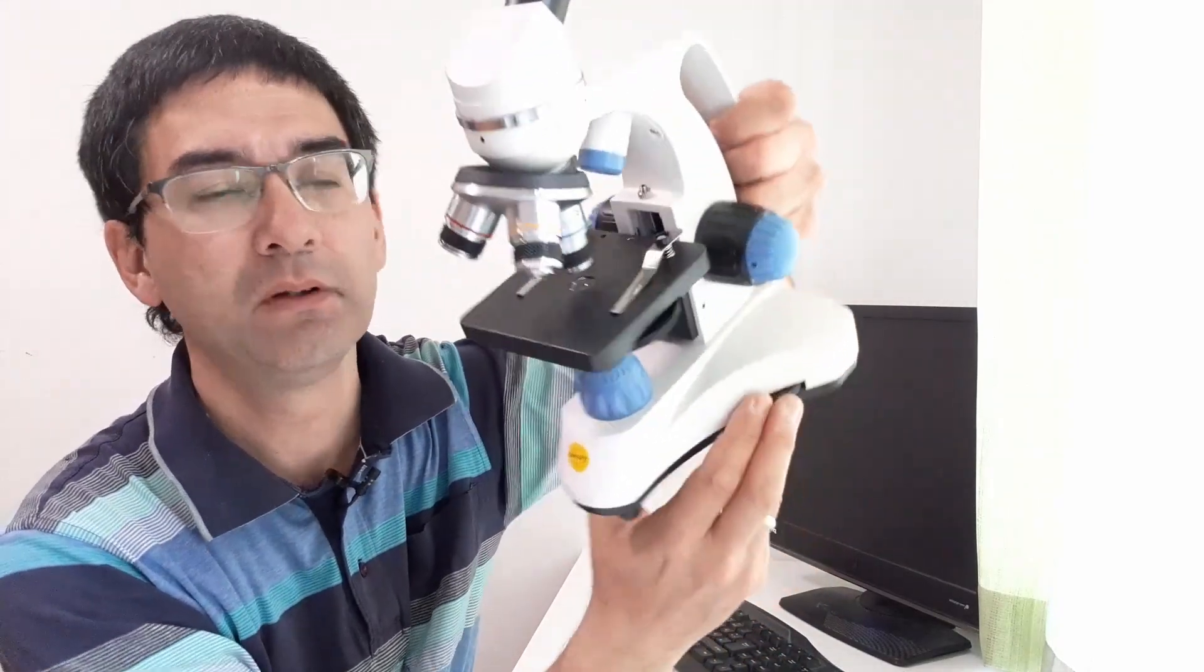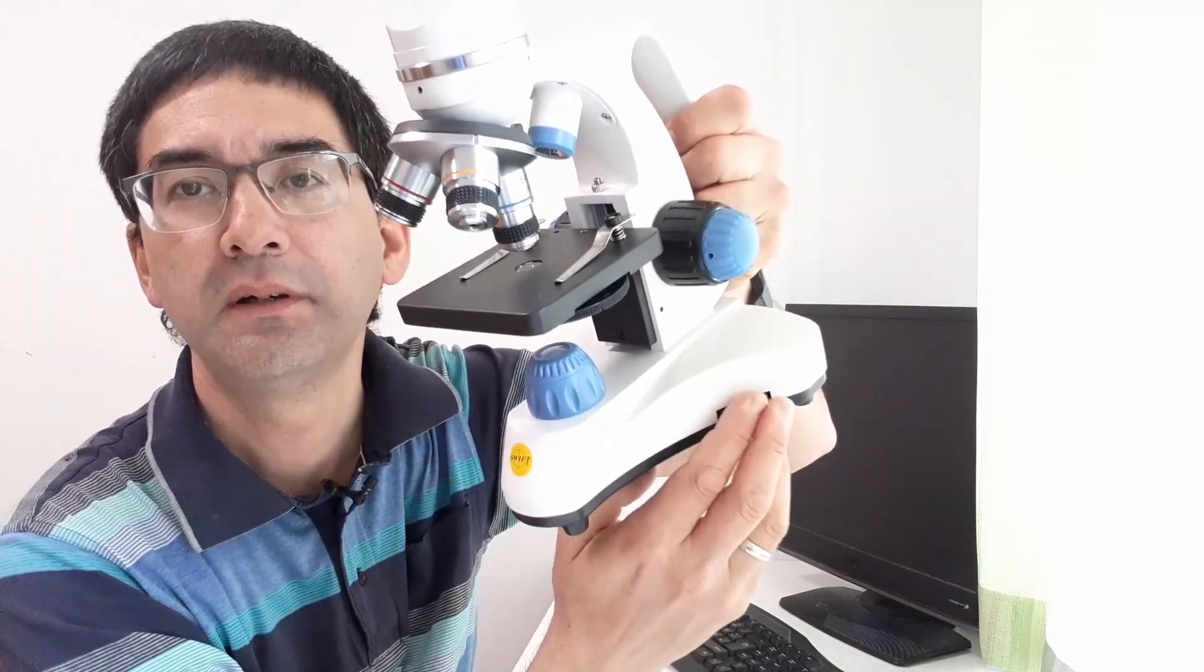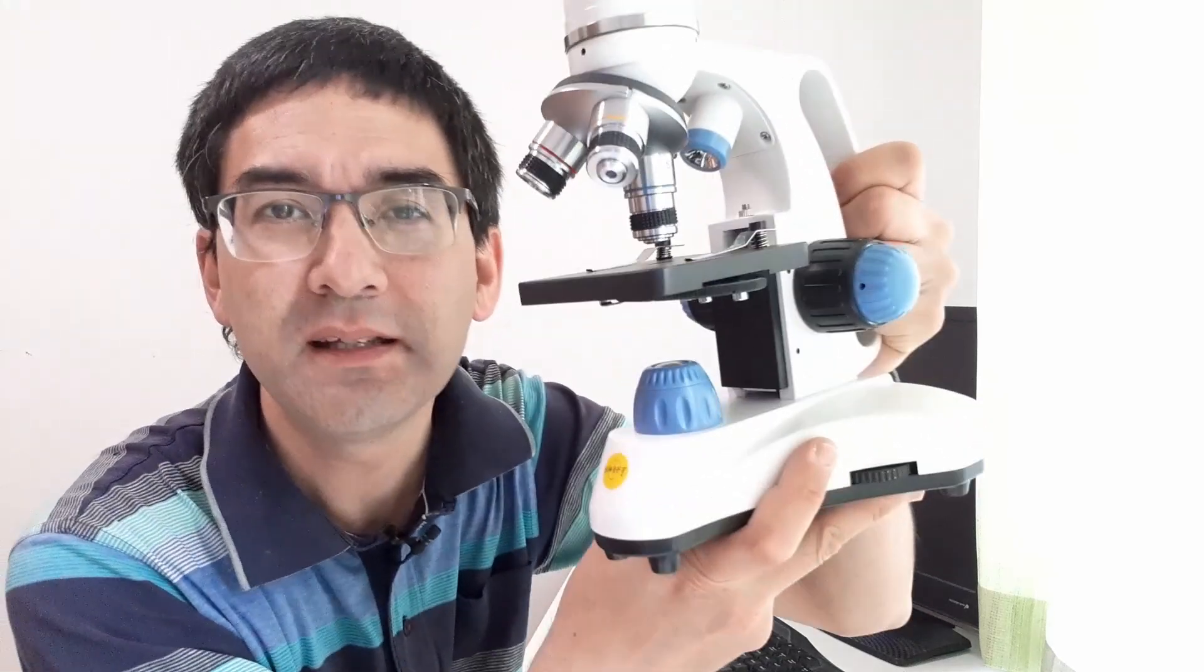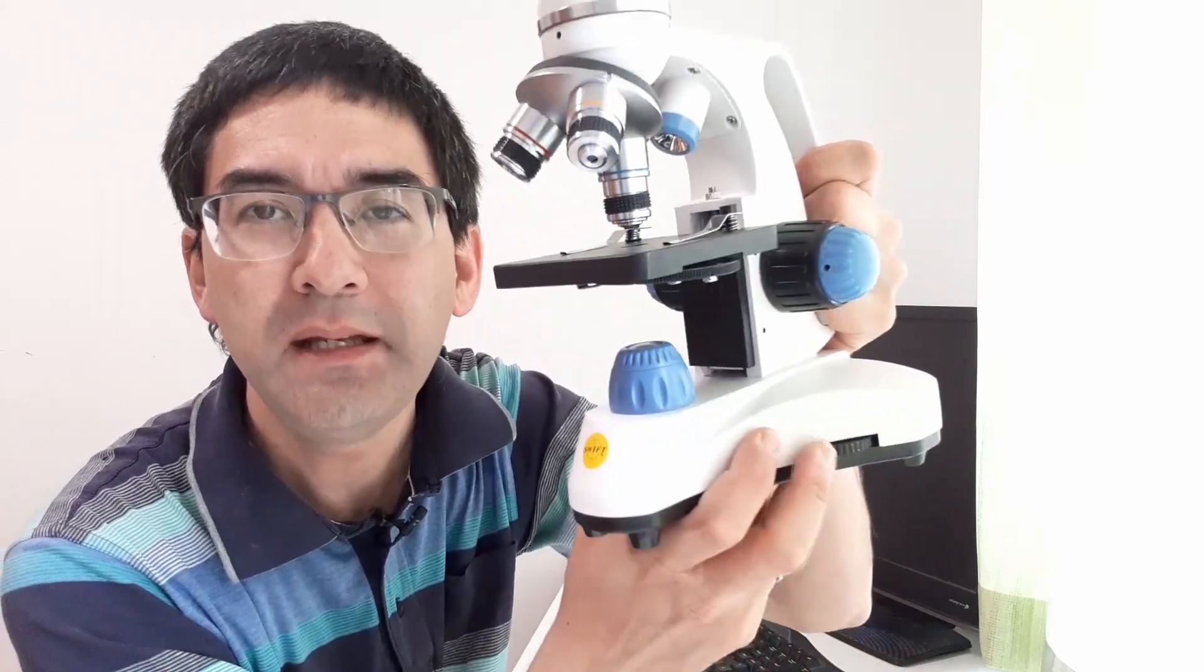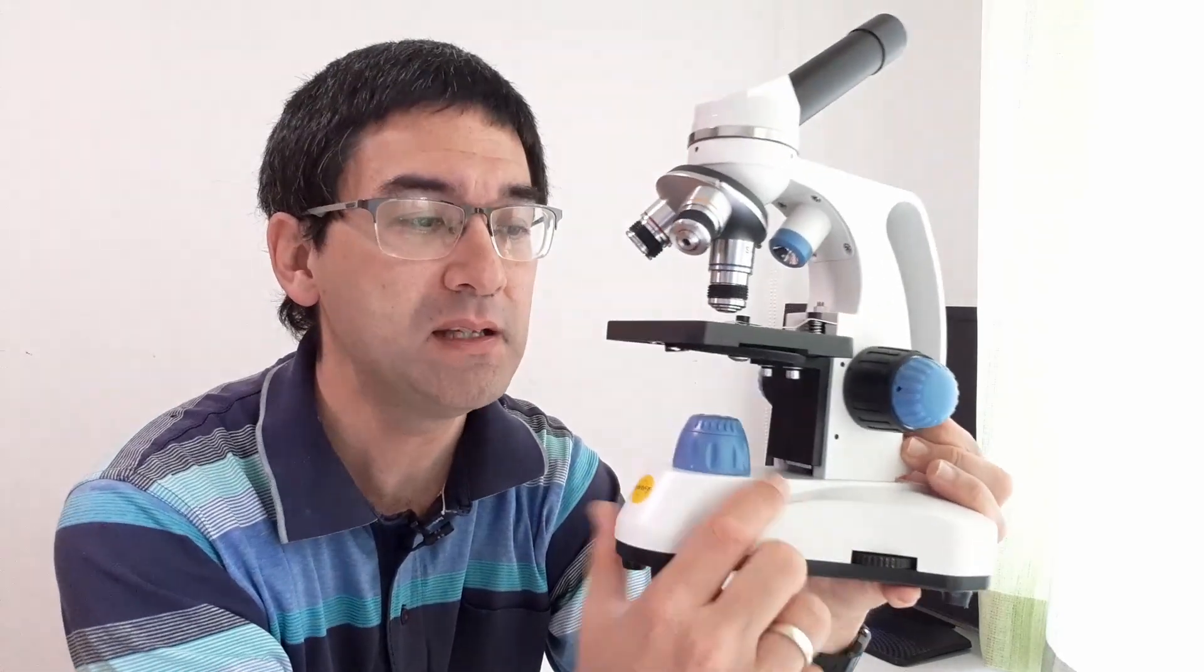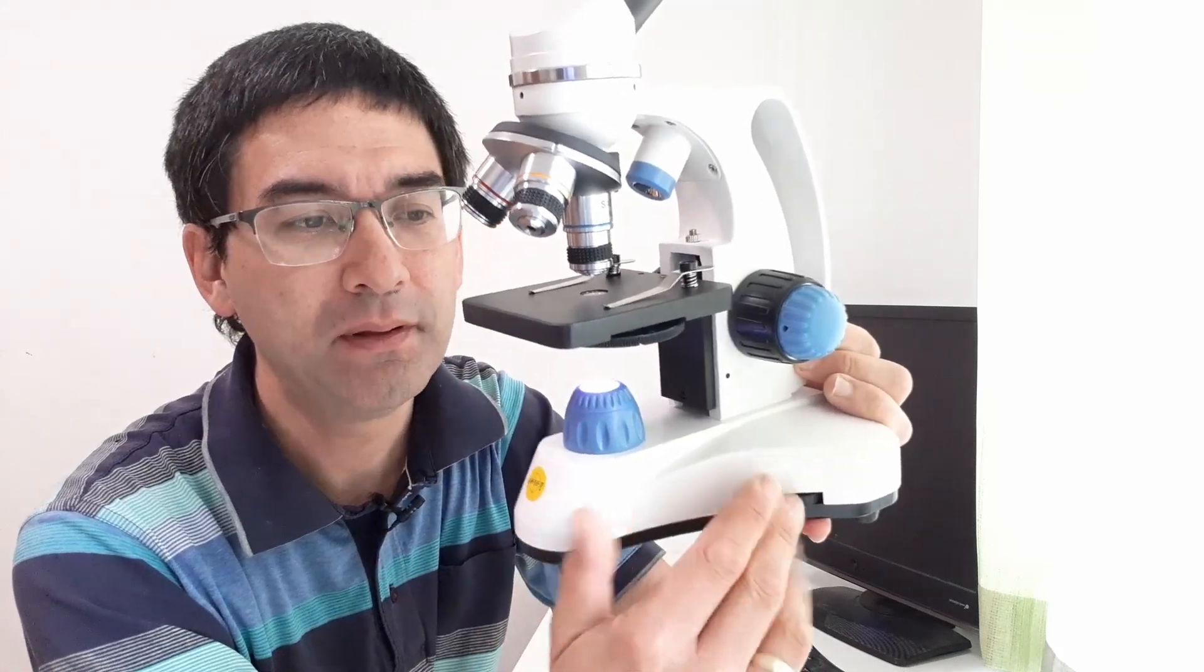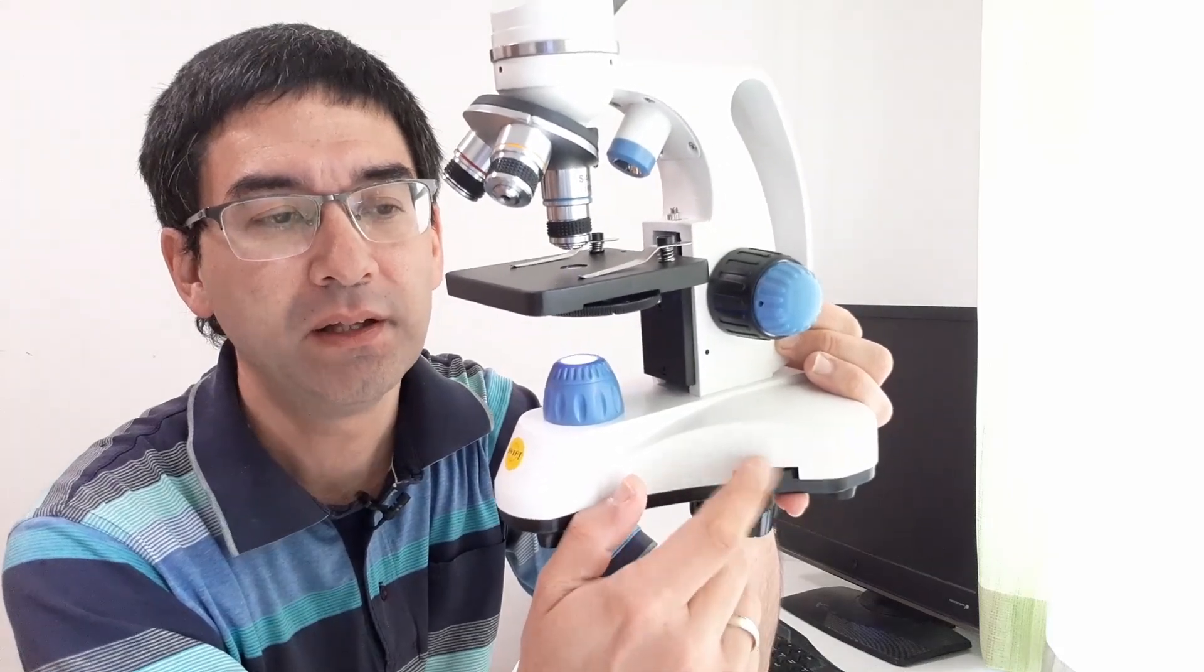I switched it on, the main switch is in the back, but look what happens when I rotate this wheel here. Maybe you can see, look at the lamp here. Of course it becomes brighter and it basically becomes dimmer. So what's so special here? Well the thing that's special is it goes all the way from all the way to bright to all the way to off. I've seen other introductory microscopes that are not that linear. They've actually really corrected this and you have the full range of brightness now and that's something that I really like.